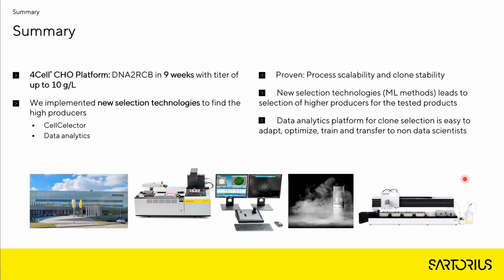The new selection technology, based on machine learning algorithms, leads to selection of higher producers, with significant differences in comparison to the more conventional way of random picking for the tested products. And at the end, we provided a platform which is easy to adapt, optimize, train, and transfer to non-data scientists. With this, I will finish the presentation here.